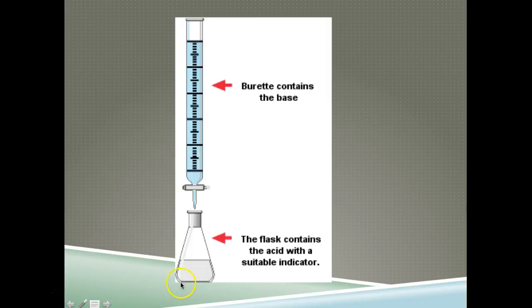That's an abrupt jump into this picture. Sorry about that. But here you can see that in the Erlenmeyer flask, you have an acid, and you have to add water to increase its volume. And then in the burette, you have base of known concentration. You'll also add an indicator to the acid. You need an indicator because otherwise you won't know when the base has neutralized the acid.